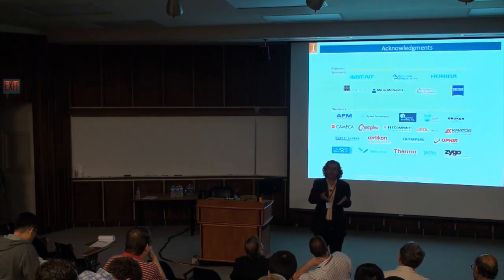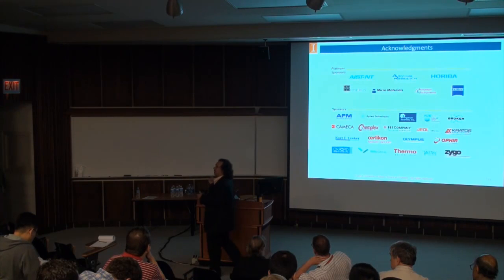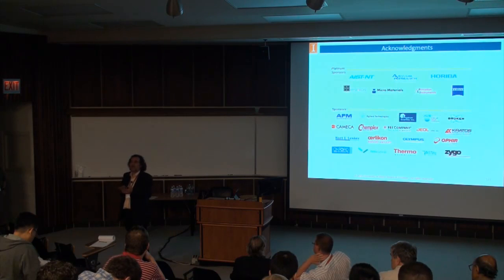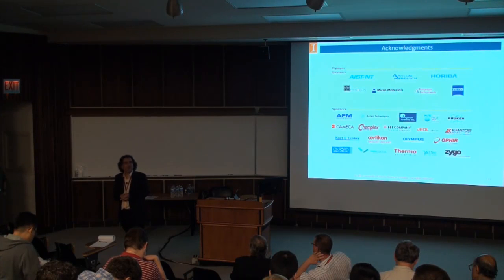There's no method to do it. You have to run them as they are. The key is, I would say a parallel plate, maybe a parallel beam configuration will be good to avoid any waving on the sample. And be very careful with the data analysis, allowing for texture orientation. It's a very, very important problem.